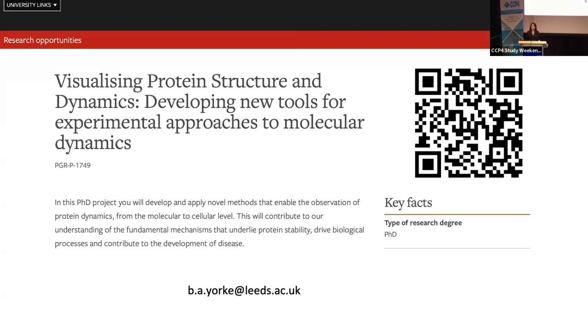Thanks. Ata Acero from City University of New York. So I had a question about the age of the crystals, and also how are you storing the crystals if they're like, because the light, was it in light? Did you put them in the dark? They were just in a box, honestly.